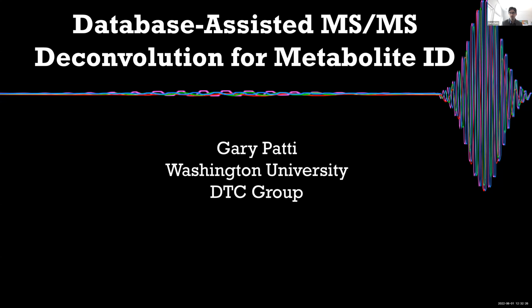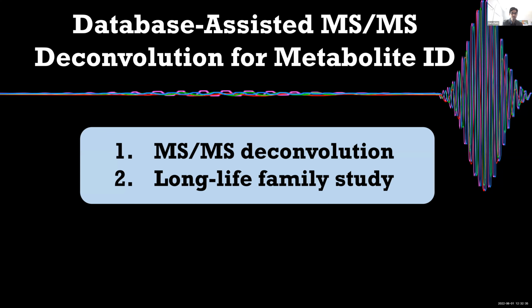All right, well, thanks everybody. Welcome to day 2. Thanks for allowing me to be the lead-off hitter here. What I'm going to talk about today is 2 things. First, I'm going to talk about some of our recent computational efforts to accomplish MSMS deconvolution. And then I'm going to talk just briefly at the end about a metabolomics application that we're doing, looking at a relatively large cohort involved in the Long Life Family Study. Let's go ahead and start here with the MSMS deconvolution.